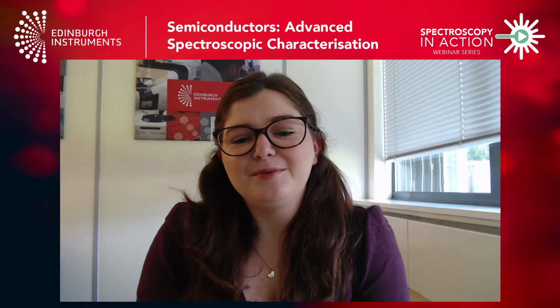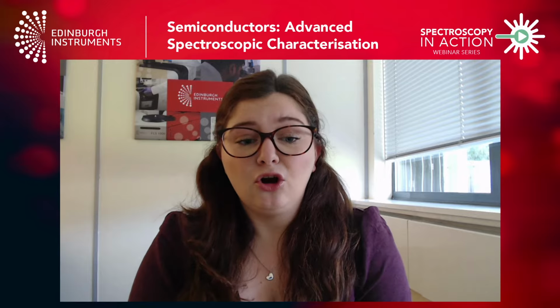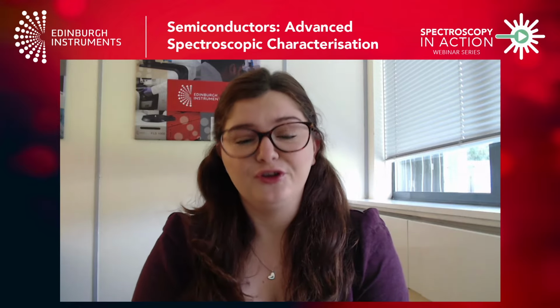discussing the advanced spectroscopic characterization of semiconductors. So today they will be talking us through several case studies showing how multimodal microscopy is being used in both research and industry for semiconductor research. This includes simultaneous Raman and photoluminescence imaging in silicon wafer, correlated Raman and photoluminescence imaging of gallium nitride LEDs, carrier dynamics in perovskites using FLIM, and more. Matthew will also show us how the RM5 and RMS1000 microscopes are configured for these workflows.